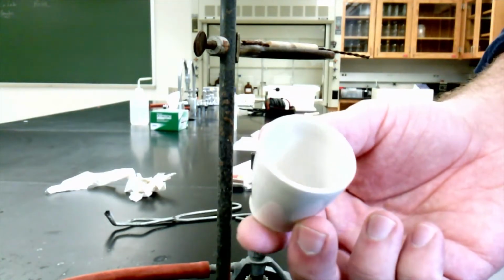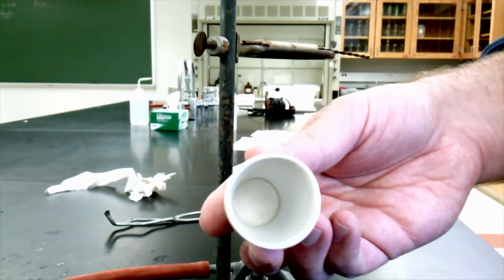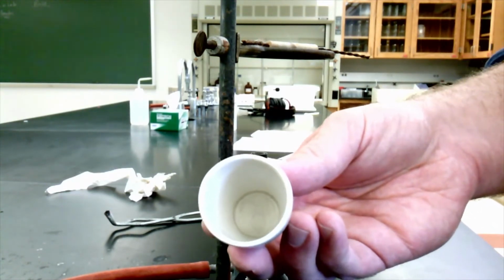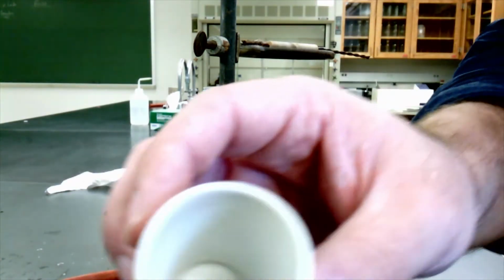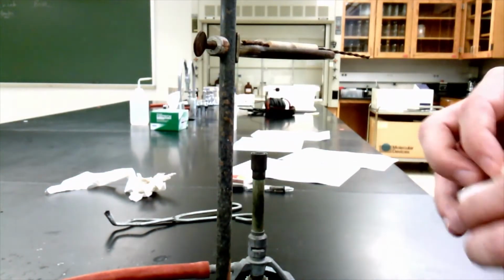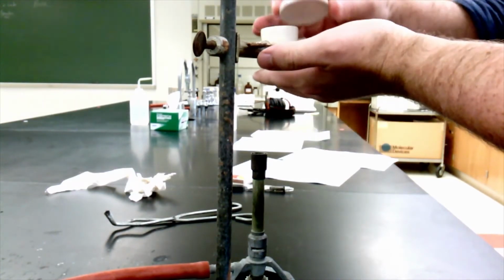To make magnesium oxide, I'm just going to burn magnesium in the air, and it's going to combine with oxygen from the air to make magnesium oxide. So I'm starting with magnesium and I'm adding oxygens to it. So I'm going to put my magnesium, which I have not yet polished, I'll do that in between takes here in a second. I'm going to put my magnesium in here, and I'm going to heat it really strongly. Is this triangle going to hold? Let's make sure before we move on.